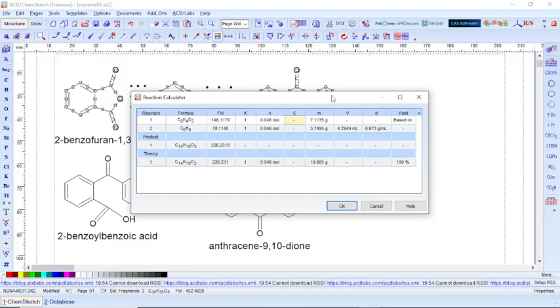But see what we're going to do. Let's try to supply a density here. Let me just assume, for instance, because I don't want to go back and start generating the density, let me just say it is 0.911.